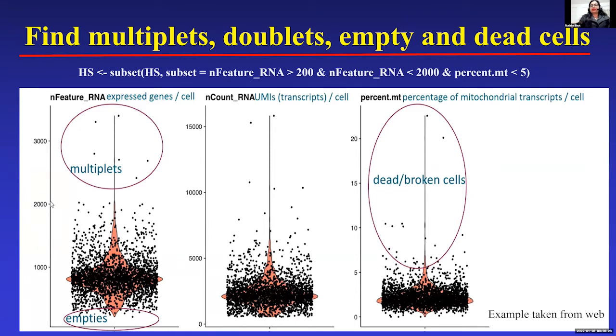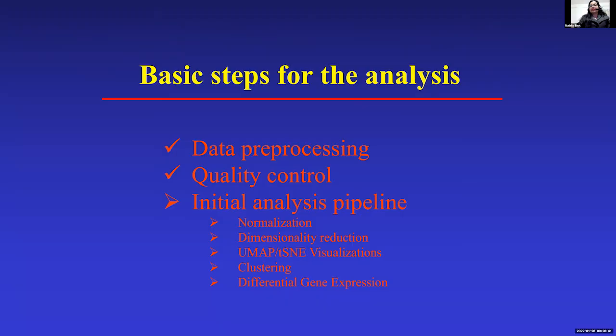But since it is a preliminary analysis and we are just getting ready as a beginner, this much will definitely clean my data so that downstream analysis is easier for me, and I'm sure that whatever I'm analyzing is clean.